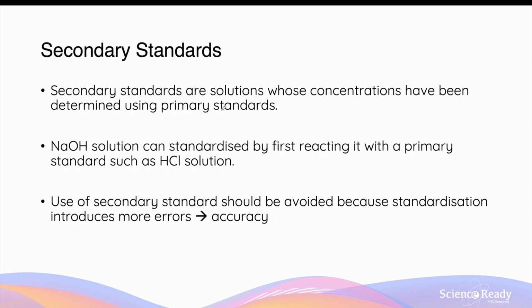been removed. Secondary standards are solutions whose concentrations have been determined using titration with a primary standard solution. You may have come across titrations that use standardized sodium hydroxide solution. While sodium hydroxide is not suitable for a primary standard because it is hygroscopic, we can actually perform a titration to determine its concentration. This process is called standardization.